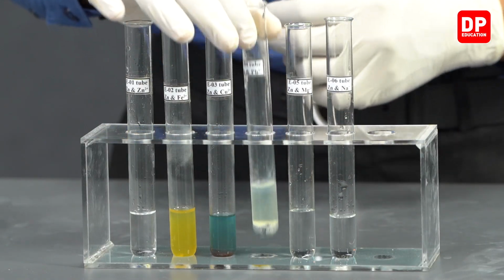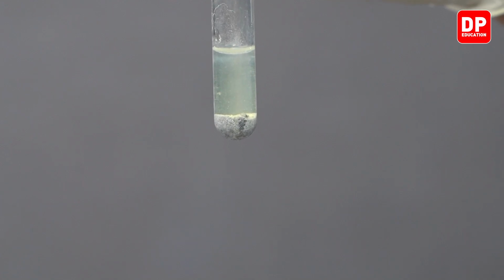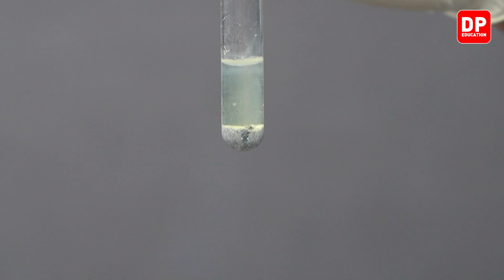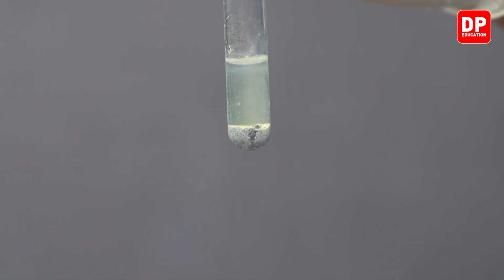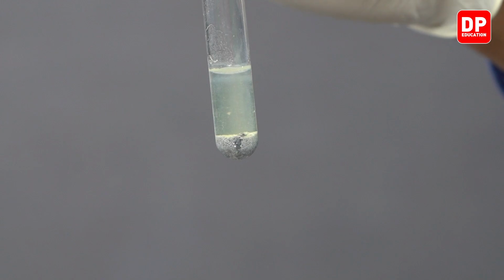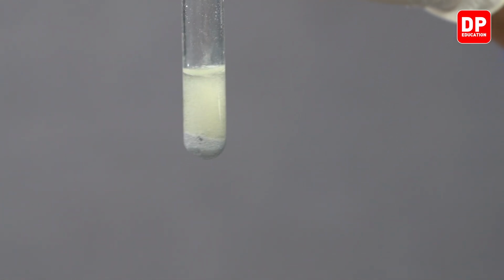What about the Pb2+ aqueous ion solution? Zinc metal was capable of displacing Pb2+ aqueous ions as lead solid. So Pb2+ aqueous ions were displaced as solid lead metal in the presence of zinc metal. So zinc is more reactive than lead. If you mix it a little bit, you can see a gray color precipitate being formed here.